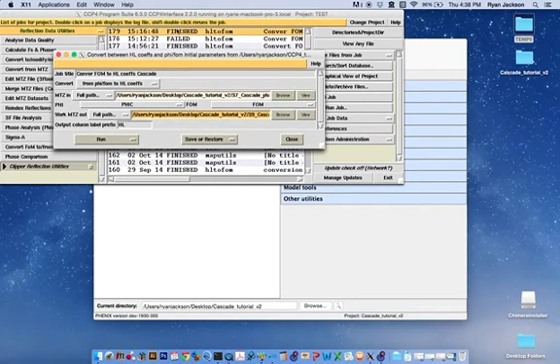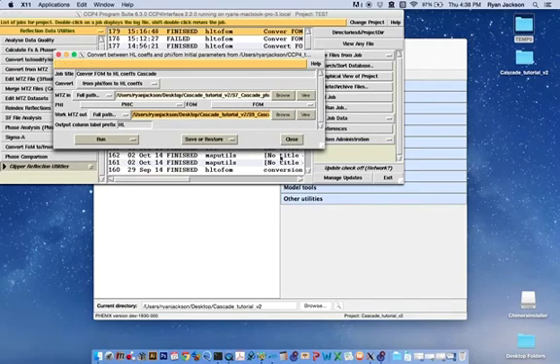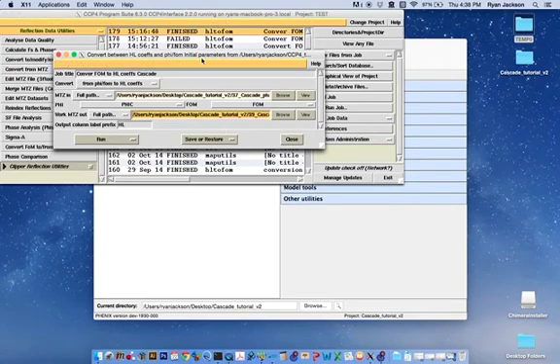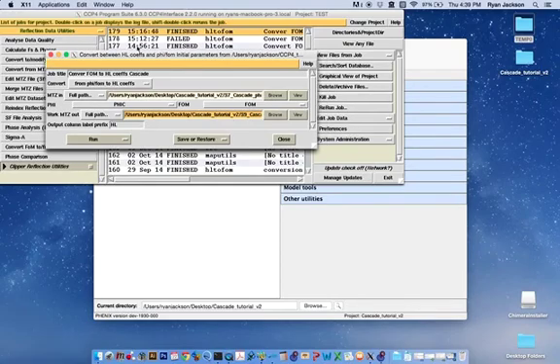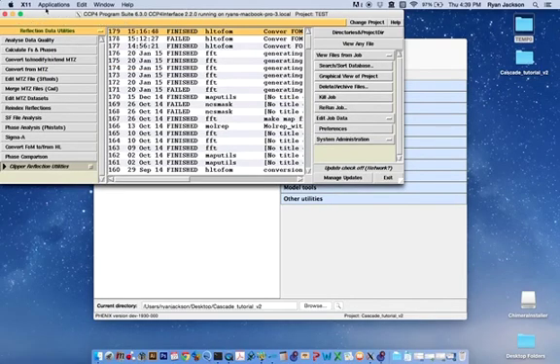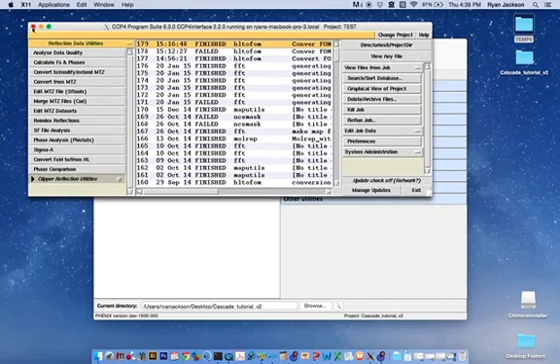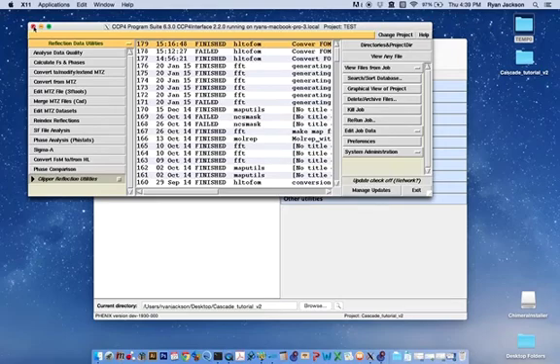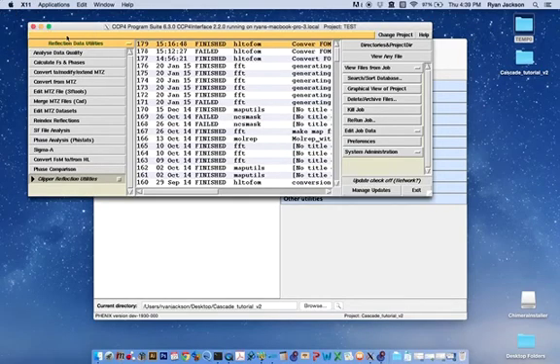Once you've hit the Run button, it finishes almost instantaneously. Now that we have Hendrickson-Lattman coefficients associated with our phaser solution, we can now merge our low-resolution phaser solution with our high-resolution x-ray data.